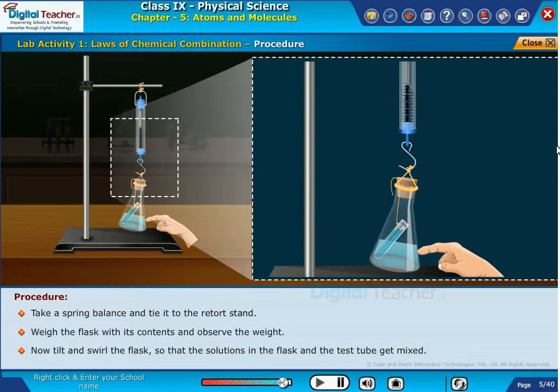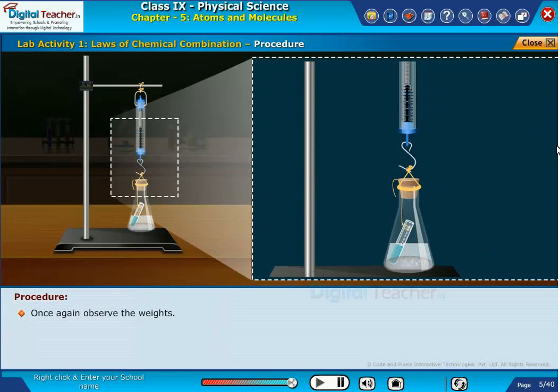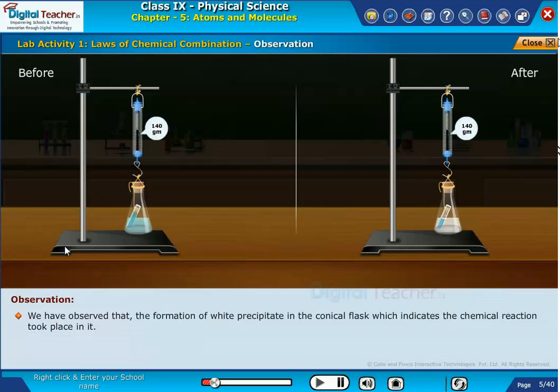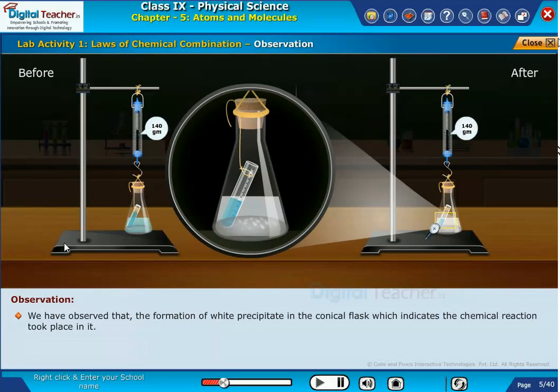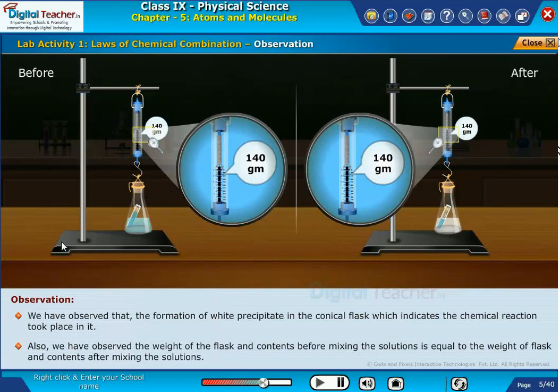Now tilt and swirl the flask so that the solutions in the flask and the test tube get mixed. Once again observe the weights. We have observed the formation of a white precipitate in the conical flask, which indicates a chemical reaction took place. The weight of the flask and contents before mixing the solutions is equal to the weight of the flask and contents after mixing.